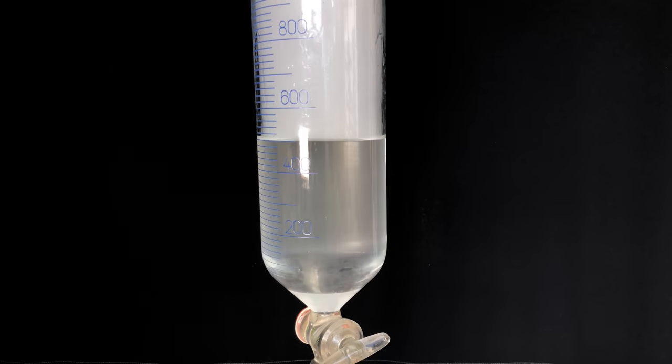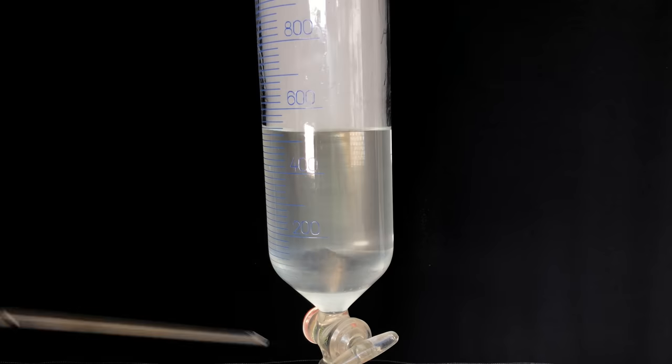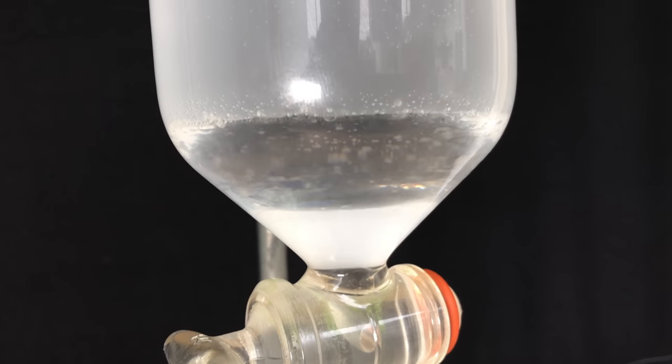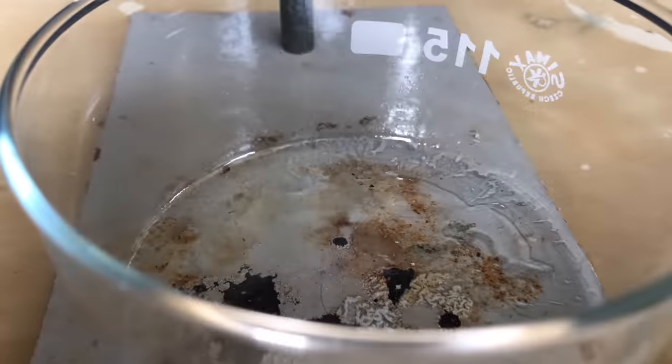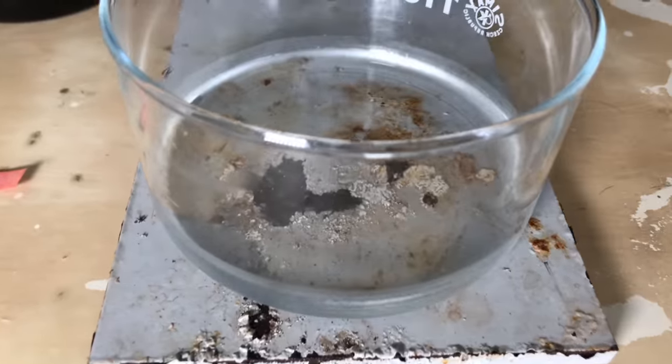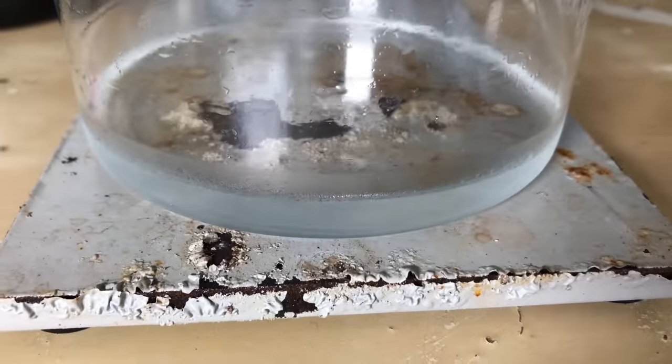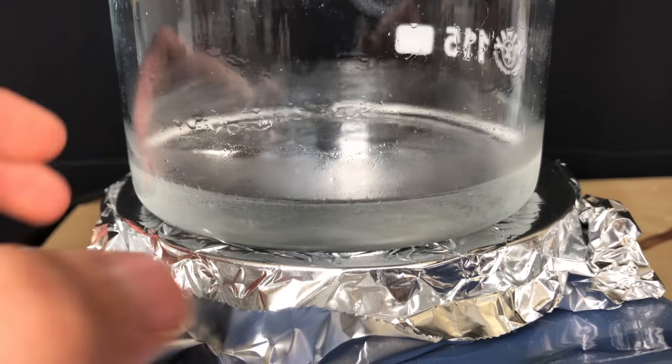The funnel was gently shaken violently, and once the layers settled, the bottom DCM layer was drained into an evaporating dish. Two more washings with about 50 ml of DCM each were performed and the layers were combined in the dish.